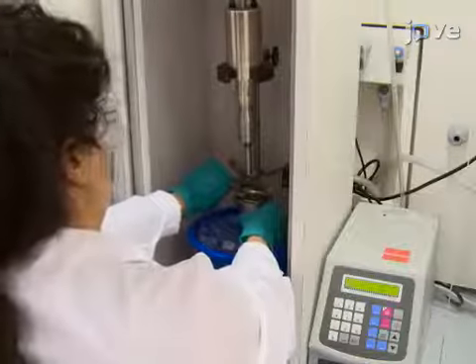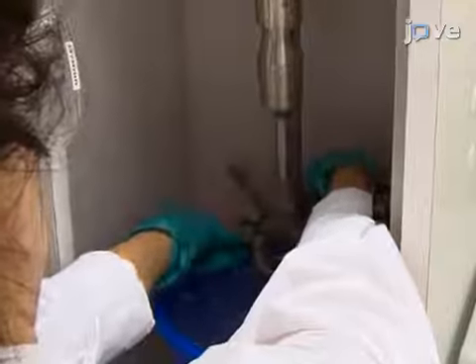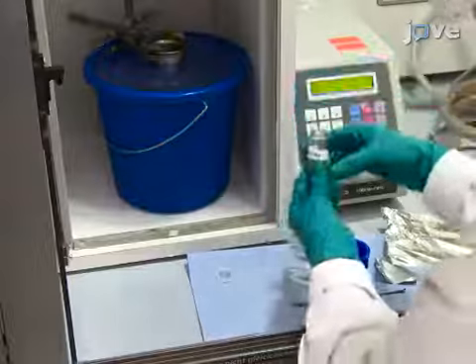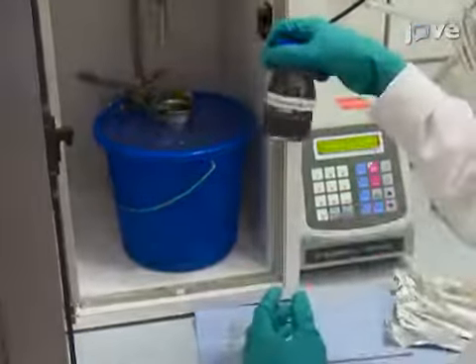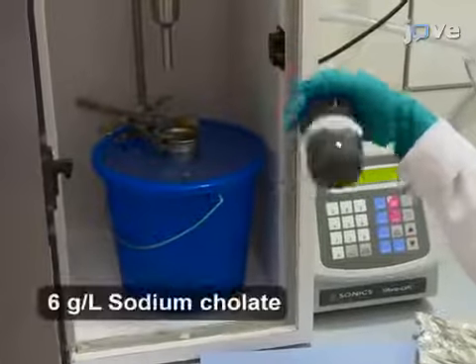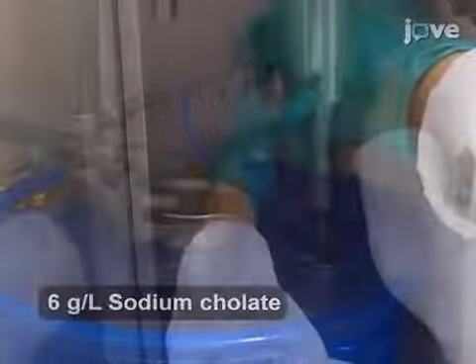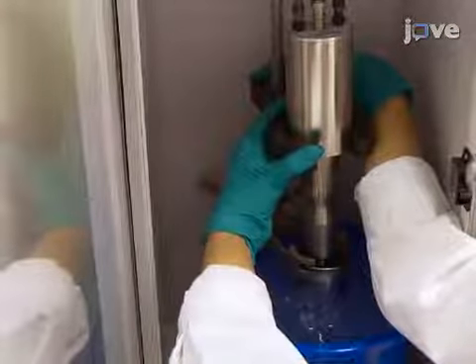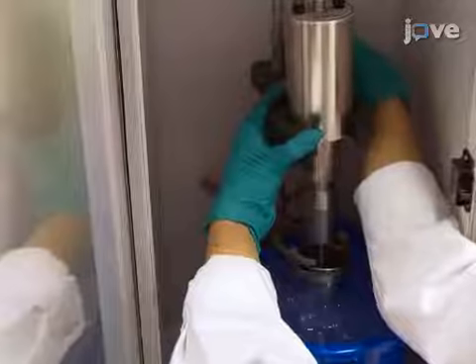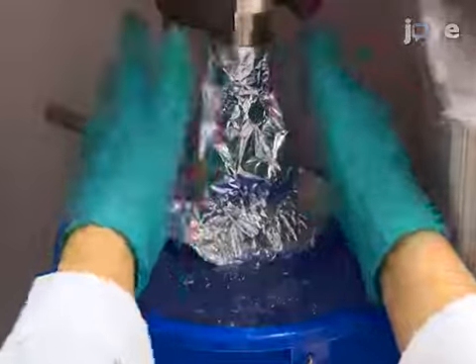To begin this procedure, mount a metal cup underneath a sonotrobe in an ice bath. Immerse 0.6 grams of a transition metal dichalcogenide, or TMD powder, in 80 milliliters of an aqueous solution of sodium cholate surfactant in the metal cup. Move the solid flathead tip to the bottom of the metal cup and then raise it approximately 1 cm. Wrap aluminum foil around the sonic probe to avoid spillage.